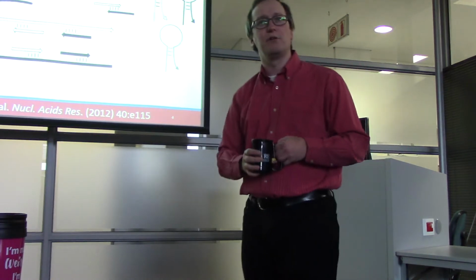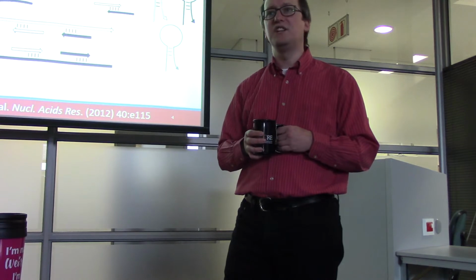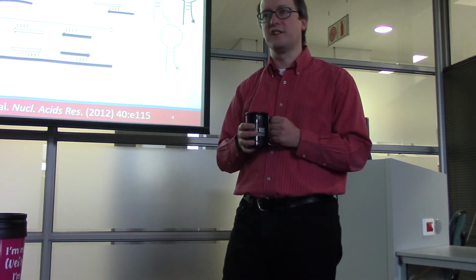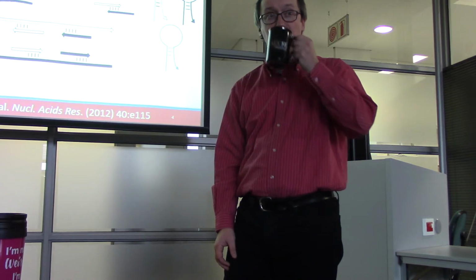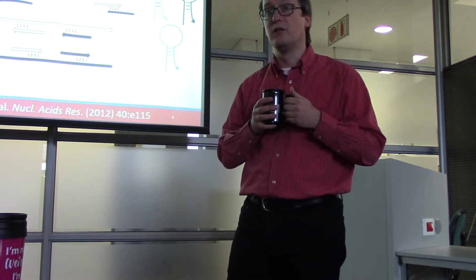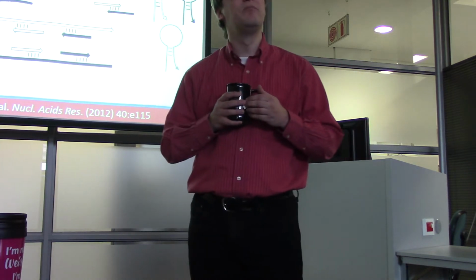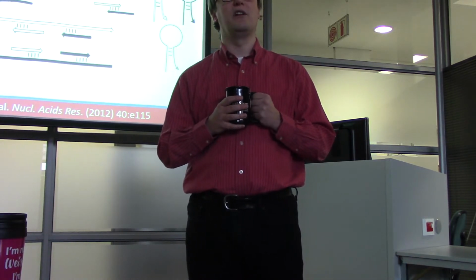Now, if you were doing a really intensive amplicon experiment, how many different targets might you incorporate in a single PCR amplification? I don't know, I'm asking this because I don't know. I don't do PCR all that typically, but I know a lot of people do. How many different targets might you go after in a single PCR reaction?